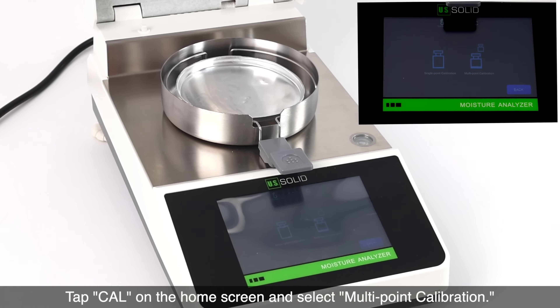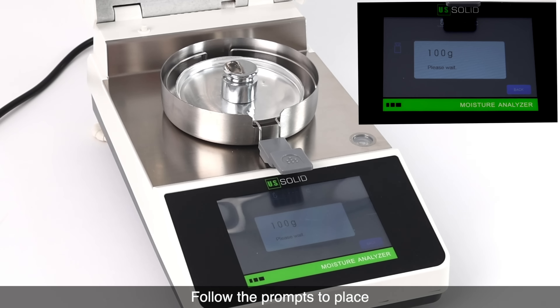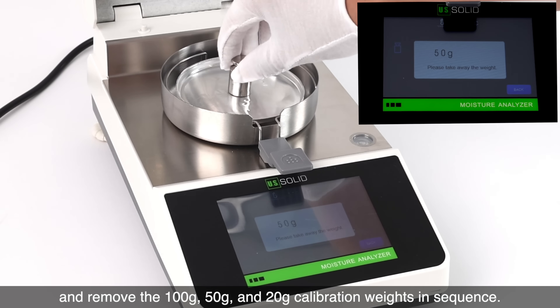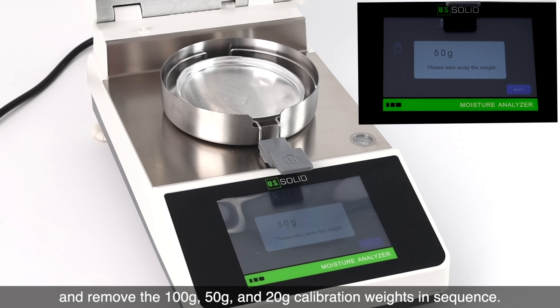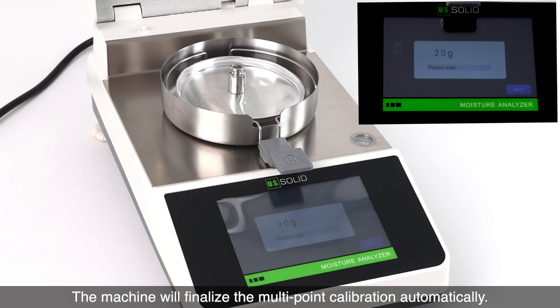Tap Cal on the home screen and select multi-point calibration. Follow the prompts to place and remove the 100 gram, 50 gram, and 20 gram calibration weights in sequence. The machine will finalize the multi-point calibration automatically.